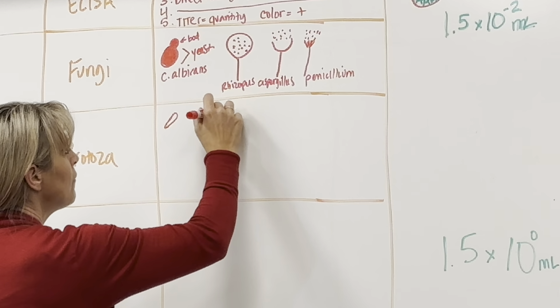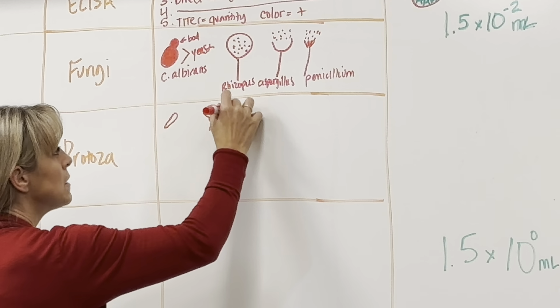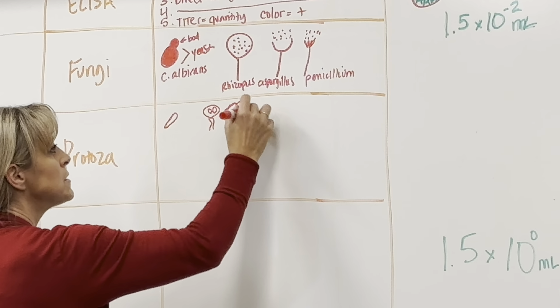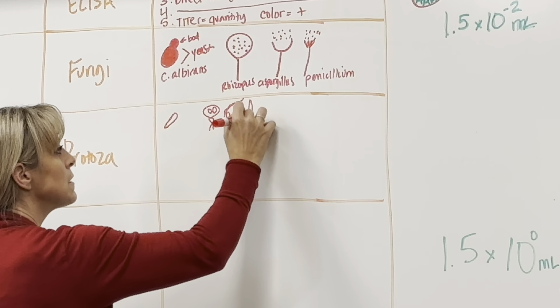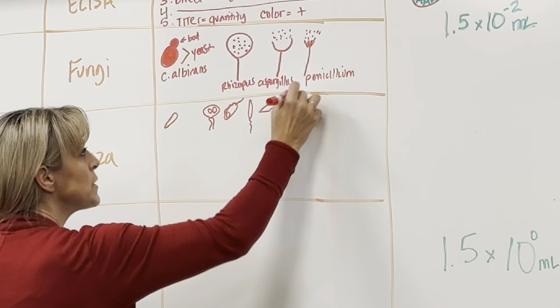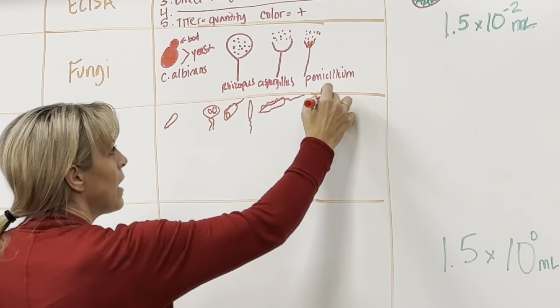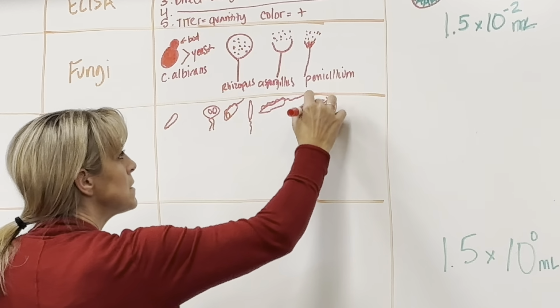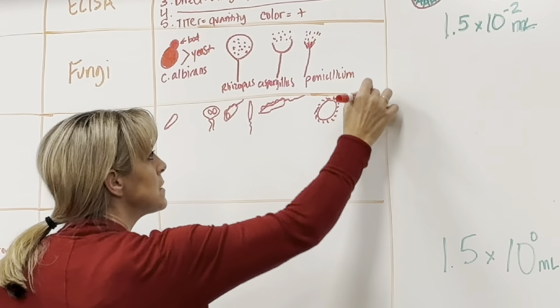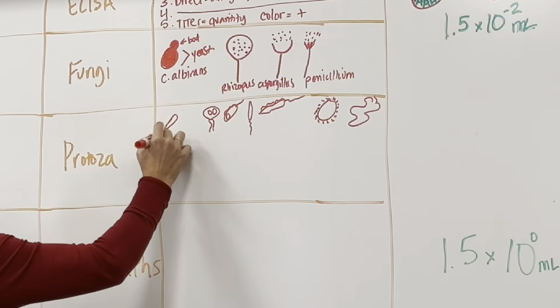Then we have these ones, and these ones, and these ones. Okay, these are non-motile.